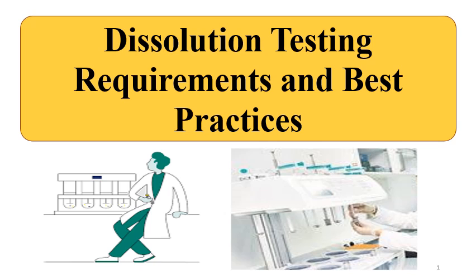Many times, products receive regulatory queries regarding dissolution testing, and once these queries are received, the applicant has to respond so that the product can get approved. If the dissolution testing requirements are not met, then the queries will be very difficult to handle. So we should understand what the requirements and best practices are.